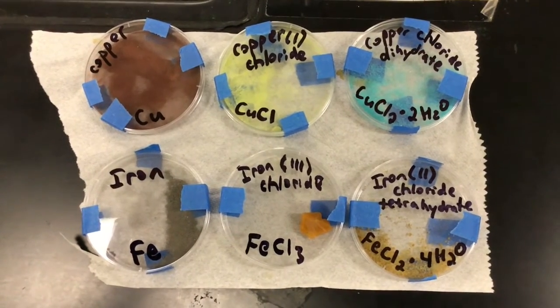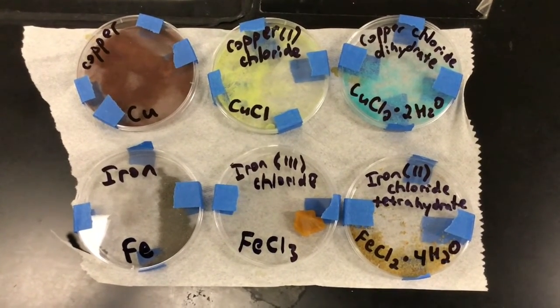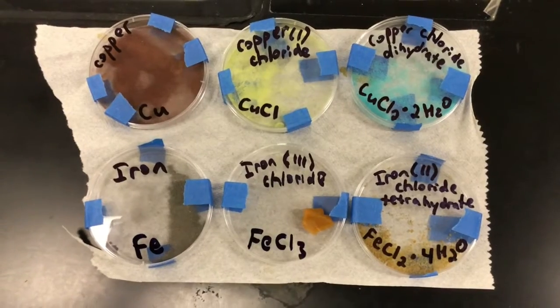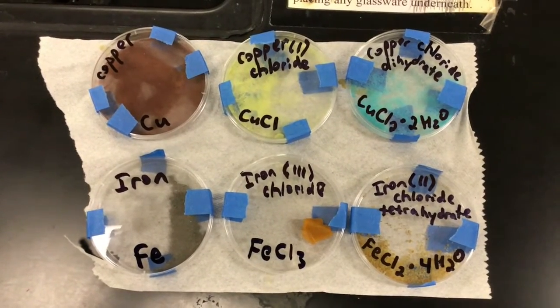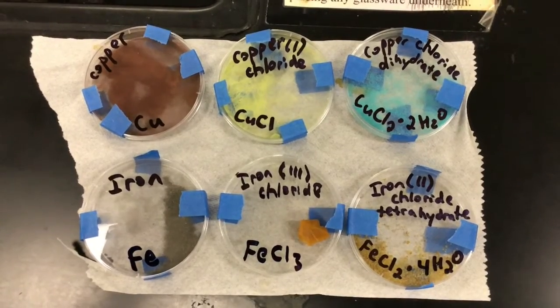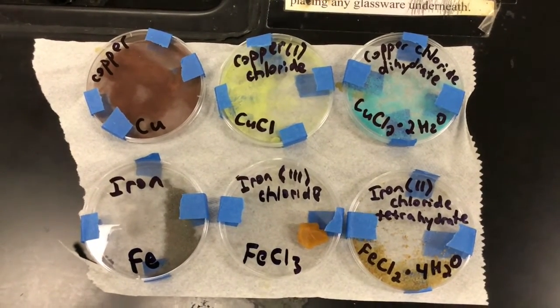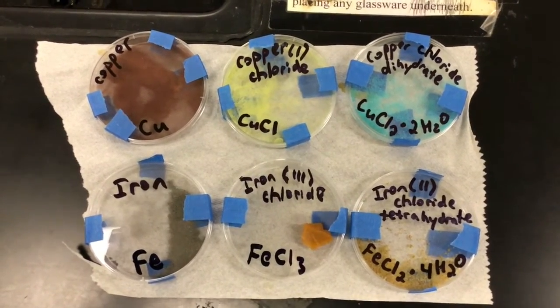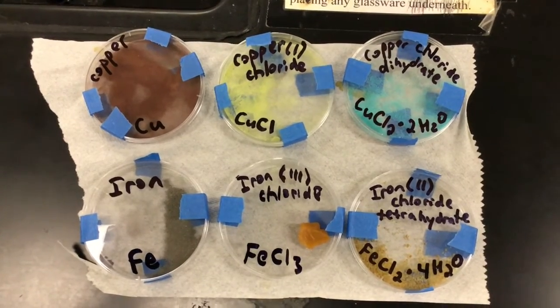The second part of the lab involves figuring out what our substances are, and one way we can do it is to compare our things with known substances. This is a snapshot of all the known substances. I'm going to zoom in on some of these here.